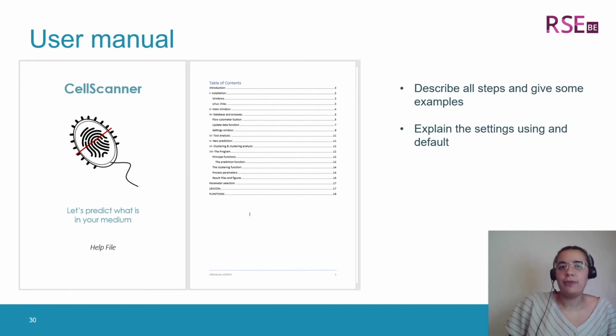The development of the tool may be imperfect, and we changed it through the whole process, but the tool is now usable by biologists, and it is already used in our lab by our teams. And it doesn't need programming knowledge, so the user can adapt it to their own needs thanks to the database and have a quick check on small communities' composition.